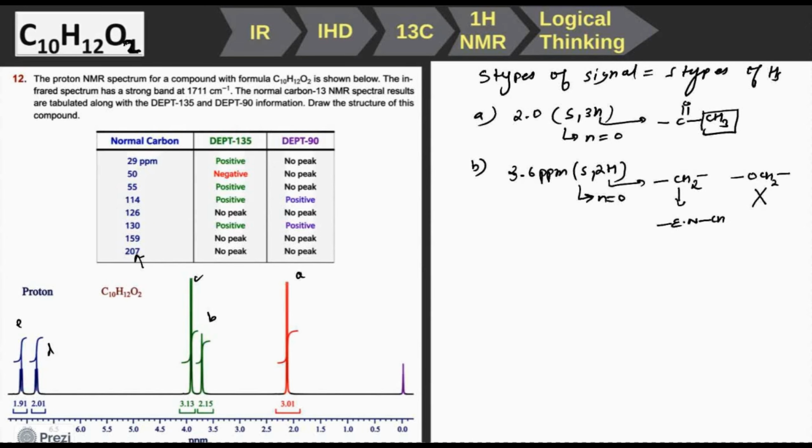It means this CH2 can be attached to two groups which are electronegative. Yeah, you can say that it could be attached to the electronegative carbon. Okay, so we will see what those electronegative carbons are when we get close to deriving the structure of the organic compound.